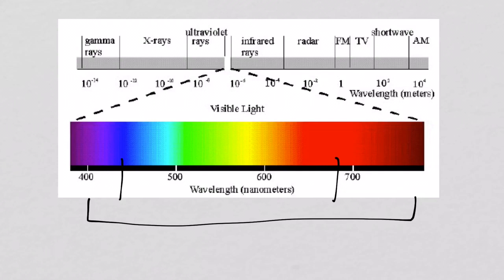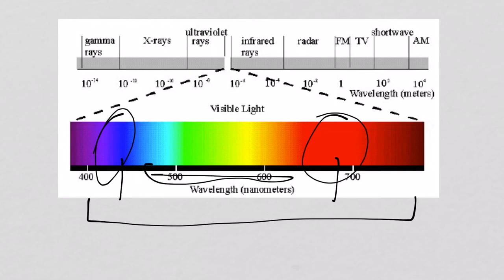And if you look at chlorophyll, it particularly absorbs in the red and in the blue. And the rest here, where it doesn't absorb very well, the combination of this gives you more or less green, and that is what we see. Right?